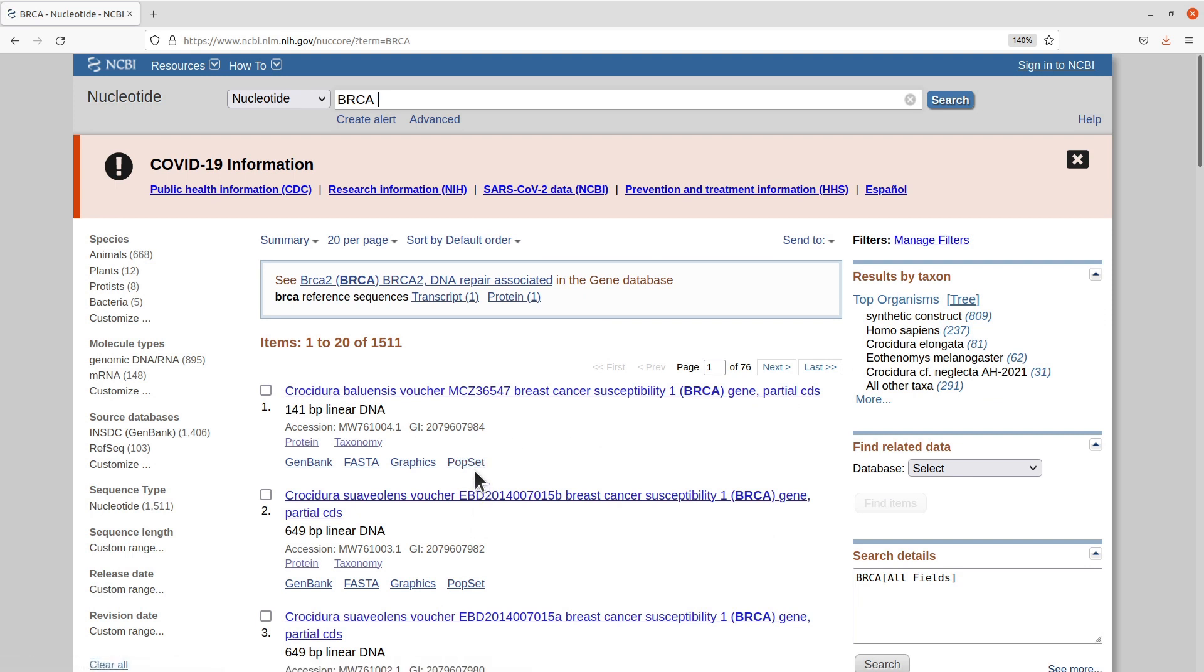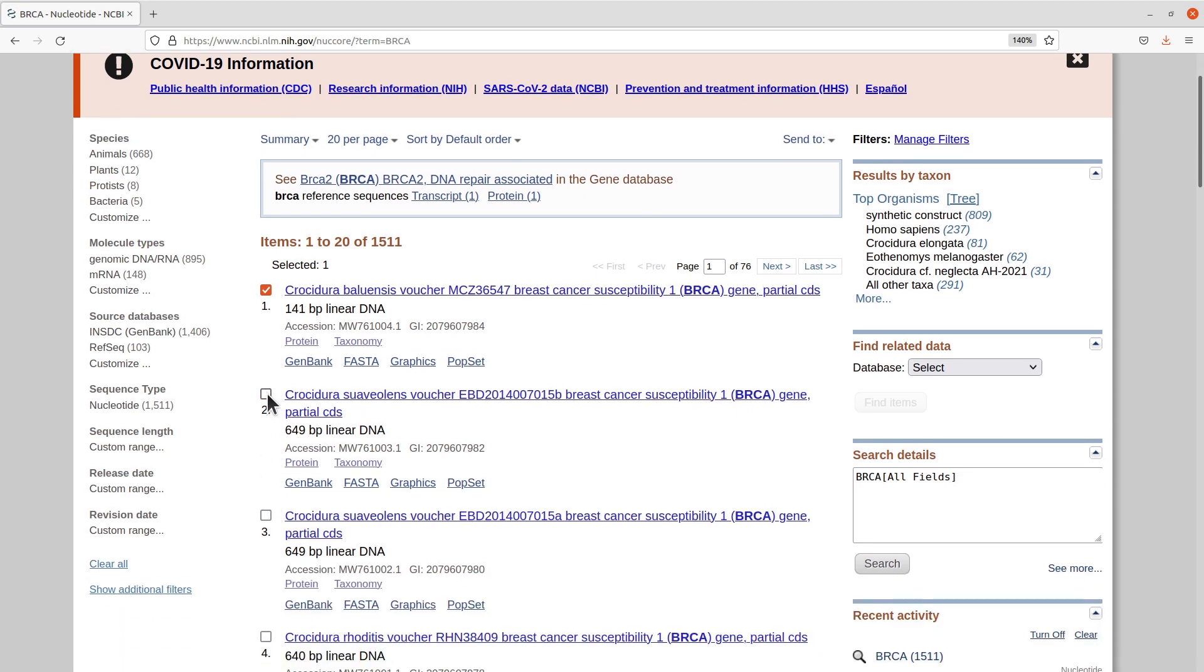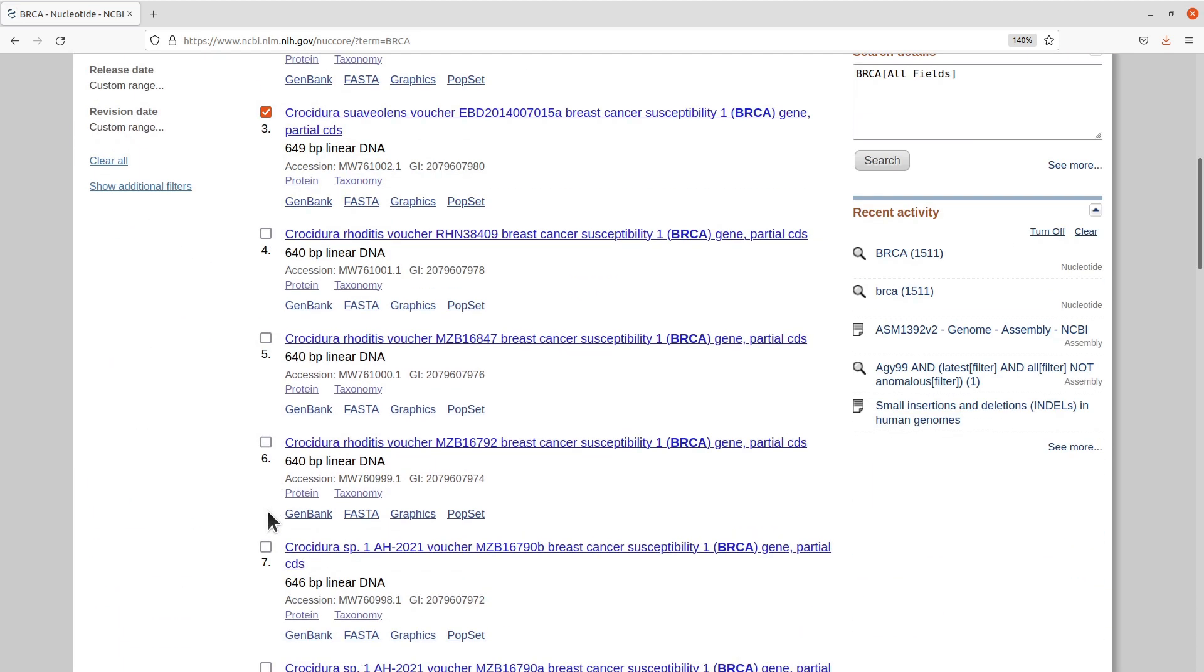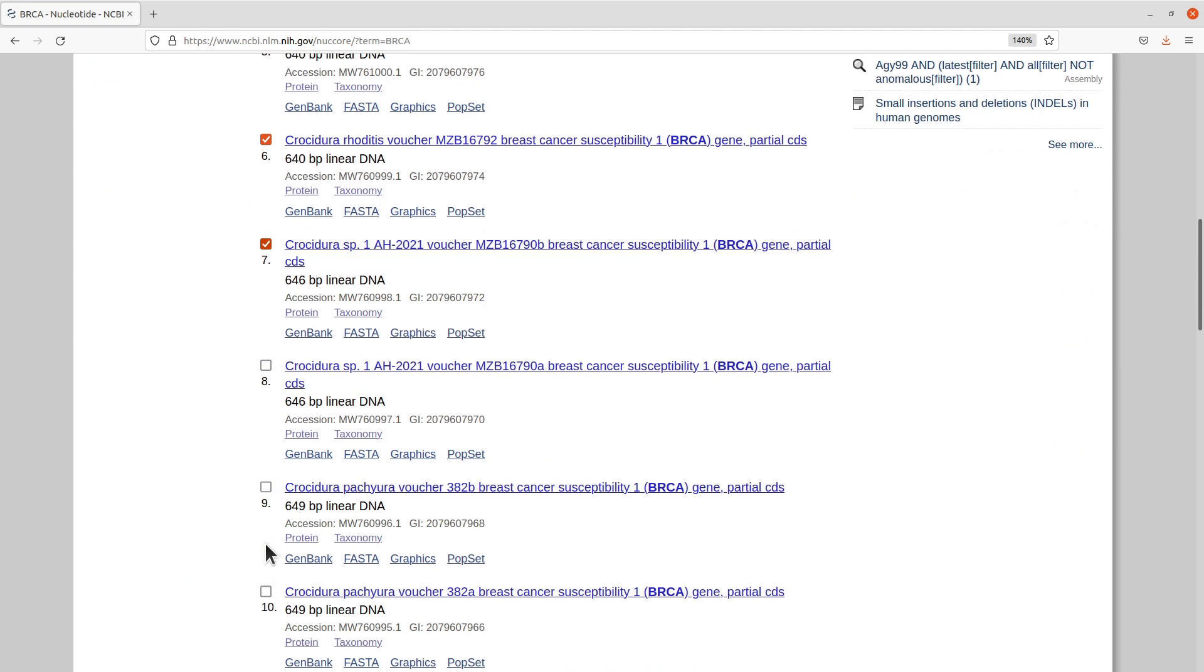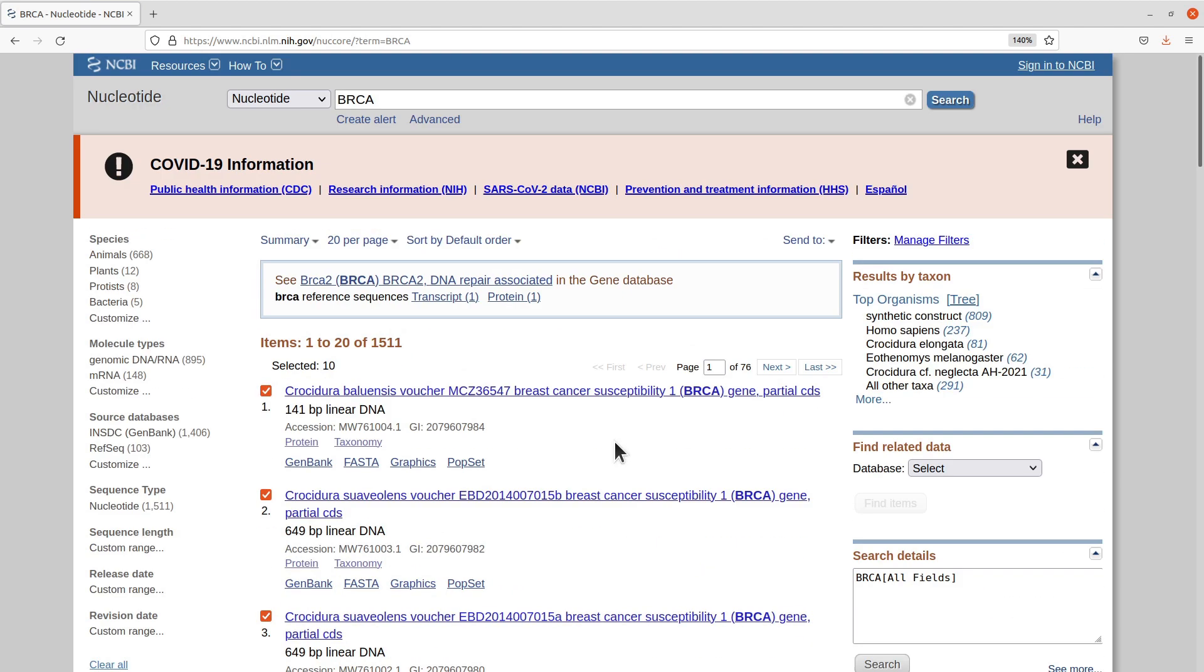I will download some of them here, but before I do that, I need to check the ones I am interested in. I'll just check them. Let me just use the first 10. You can also use 5 or any number. The point here is to just get this number so that we know the answer we are expecting. When you select the sequences of interest, you will see the number of selected sequences here. Mine is 10, because we have selected 10.